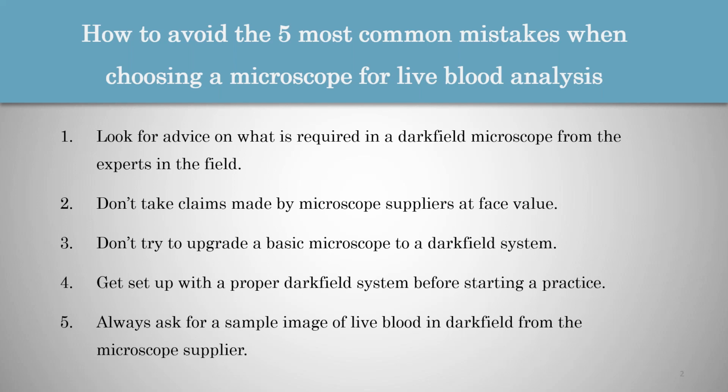Right, and then thirdly, it's also not advisable to try and upgrade a basic microscope to a dark field system. We have seen some videos and suggestions by people out there on how to create your own dark field condenser and how to create a dark field microscope with a basic bright field microscope. And unfortunately, there really is no loophole that can be exploited.